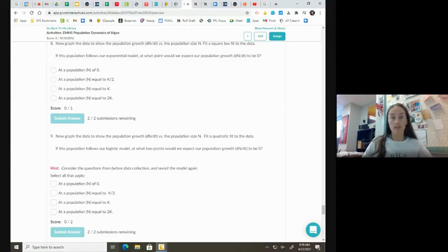Okay. Not on the slope. If you're on the huge slope, the exponential portion, then that's not the growth rate we want. That would be the growth rate for exponential growth. But if you apply that growth rate to a logistic model, you're going to overshoot your carrying capacity. So when it says maximum growth rate, it's not talking about the maximum it ever was. It's talking about the maximum growth rate that it can sustain at carrying capacity. And that's why I pick that growth rate right when it hits carrying capacity.